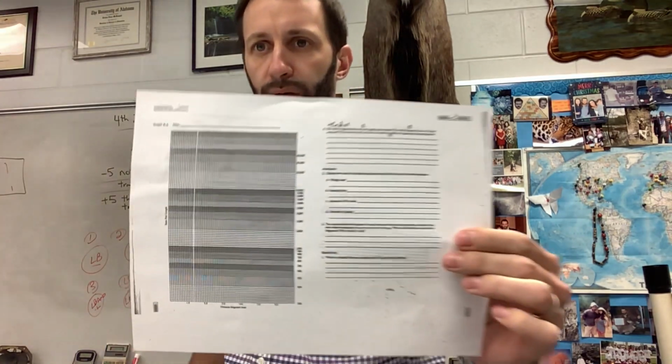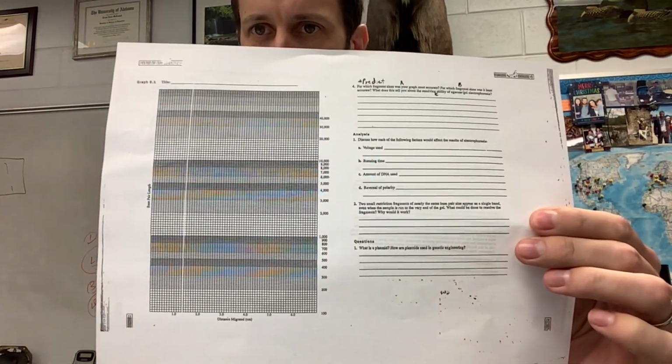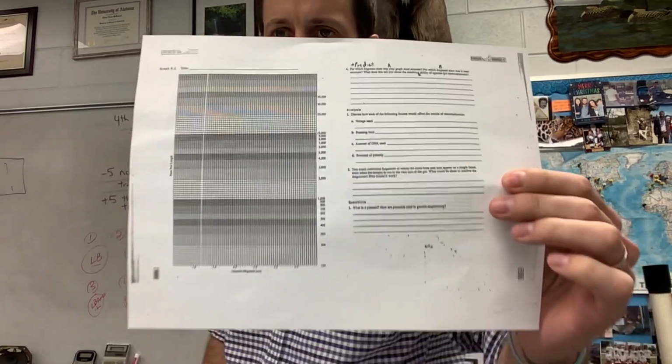So today we're working on this graph. It's on a logarithmic scale, so it looks kind of weird and funny, but it's gonna work out. What you're gonna do is use the data from this side. Now, I told you guys yesterday, the data is off one decimal place. So where it says how far the DNA traveled, you need to move the decimal over one to the left. So it should say like 1.1, 1.6, 1.8.